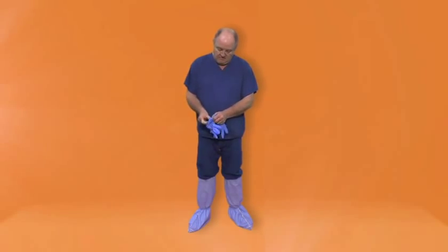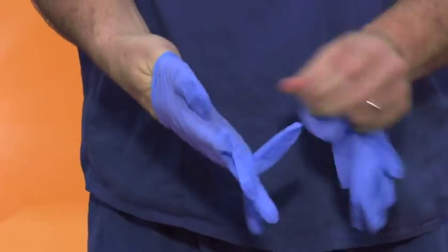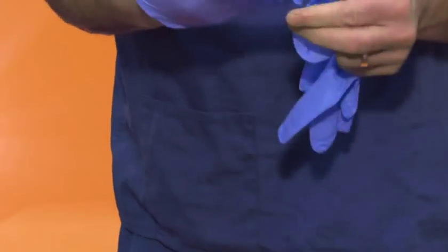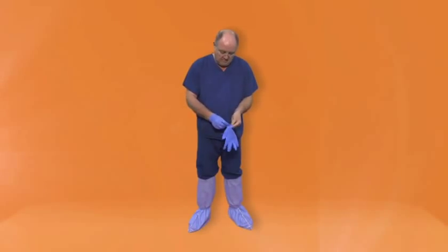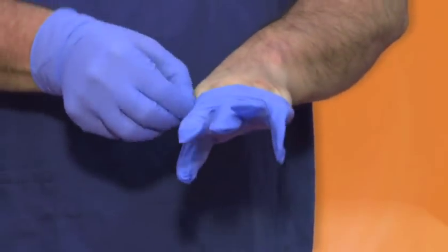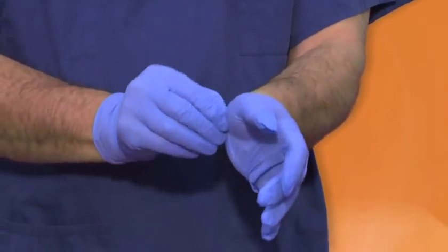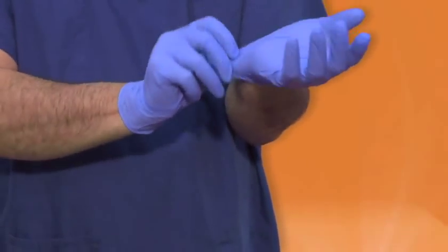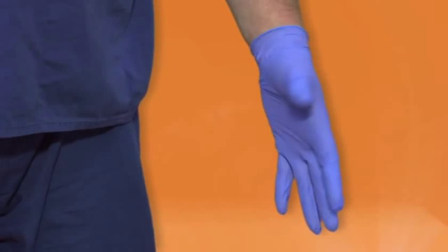Inner gloves. You should only use nitrile gloves. These should be put on one at a time. If you experience any breaches in your inner gloves, remove and start again.